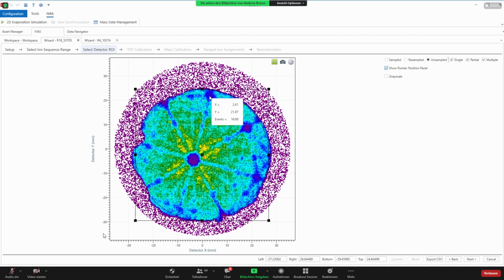And then this is our 024. This is 3.03, 21.66. And then this is our 113, and this is going to be 17.72, 9.18.